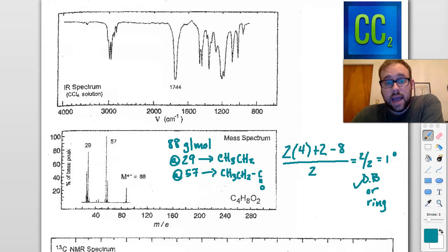Now, if we look at the IR, there's only one major peak. We don't see anything above 3,000. So we can pretty much get rid of carbon-carbon double bonds that have hydrogens attached to any type of alkenes and things of that nature. But we do have a very clear carbonyl peak at 1744.